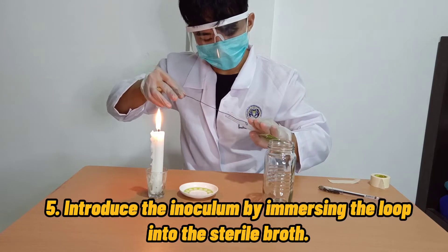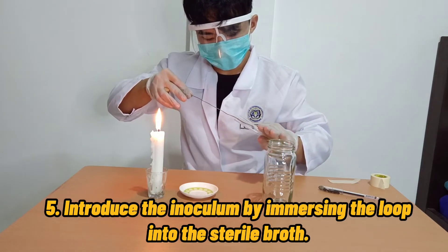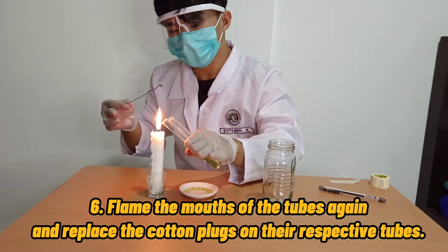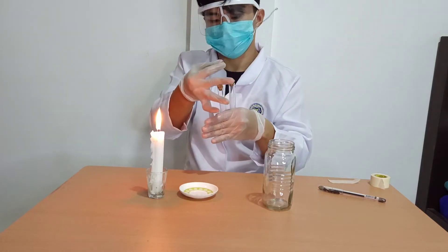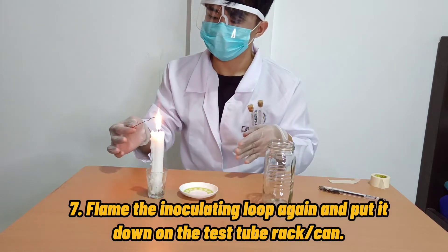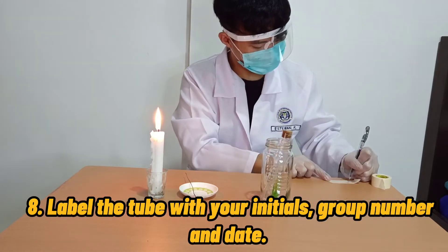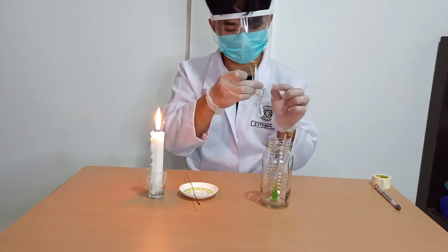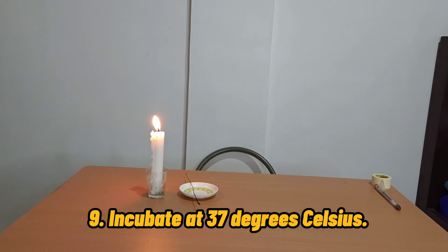Fifth, introduce the inoculum by immersing the loop into the sterile broth and shake the loop to free the microorganisms sticking to it. Sixth, flame the mouths of the tubes again and replace the cotton plugs or cork on the respective tubes. Seventh, flame the inoculating loop again and put it down on the test tube rack or can. Eighth, label the tube with your initials, group number, and date. And ninth, incubate at 37 degrees Celsius inside the incubator.